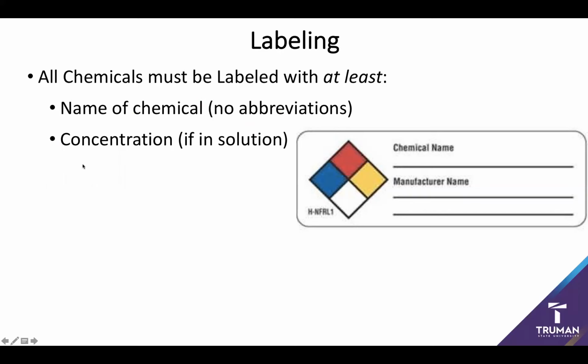And it turns out when isopropyl interacts with the nitric acid, well, that ends up generating a fairly exothermic reaction, which ended up spraying a nice mixture of nitric acid and isopropanol all over the room. So this did cause the student who was using the isopropanol to have some acid burns. Now, quick use of a chemical shower managed to help keep the damage to a minimum. But the real question is, why did this happen in the first place? And the answer is improper labeling.